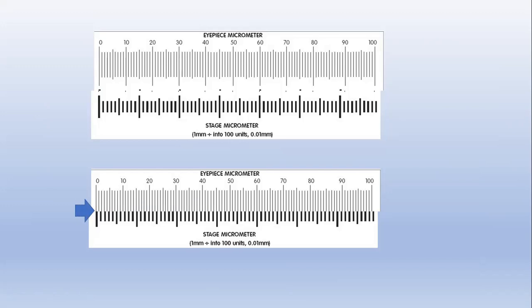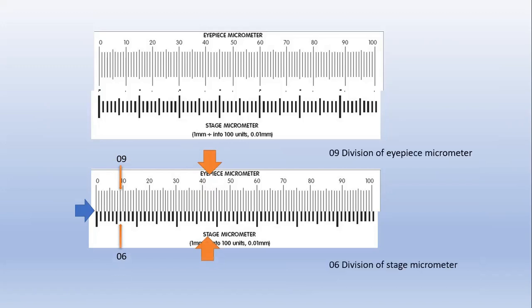Counting: one, two, three, four, five, six, seven, eight, nine. The ninth line of the eyepiece micrometer coincides with the sixth line of the stage micrometer. The divisions are different — nine on the eyepiece and six on the stage micrometer — but the distance is the same, as shown by the black line. The distance from zero to the ninth eyepiece line equals the distance from zero to the sixth stage micrometer line.